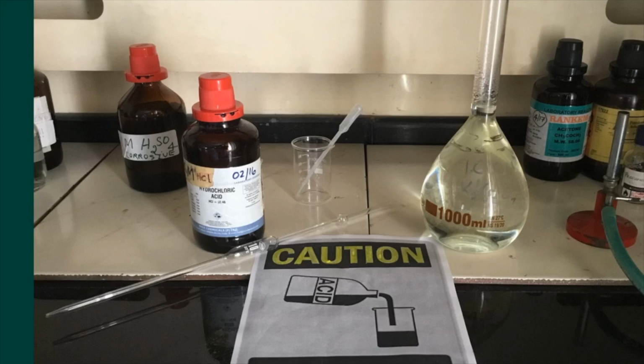But if we had a scenario where we were diluting a solution of acid like the student is asking for in this video, then you should remember that you always add acid to water and not the other way around.